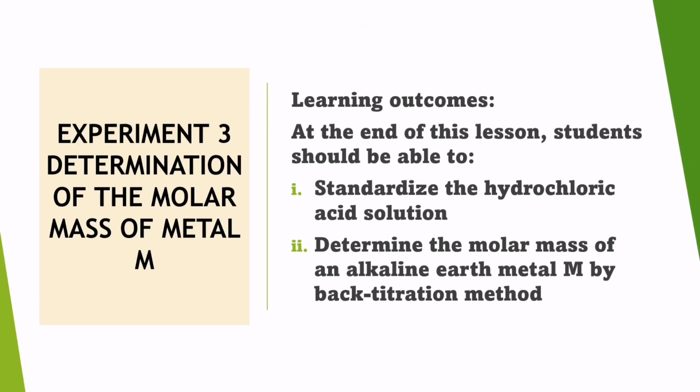So we want to know the learning outcome for this experiment. At the end of this lesson, students should be able to standardize the hydrochloric acid solution and determine the molar mass of alkaline earth metal M by the back titration method.